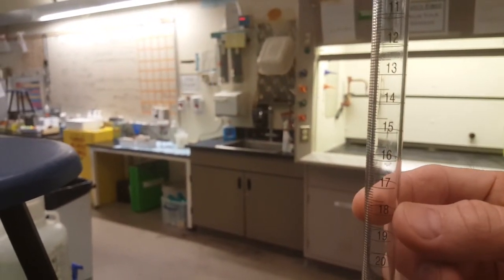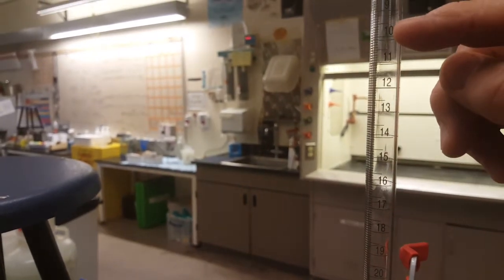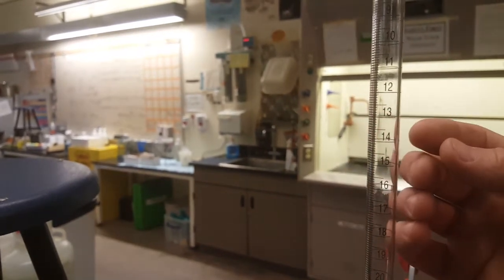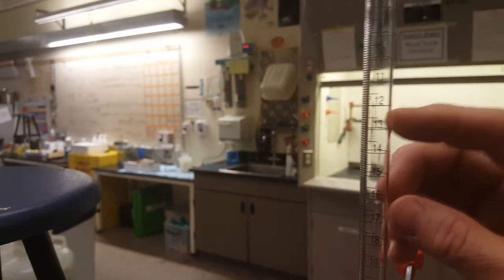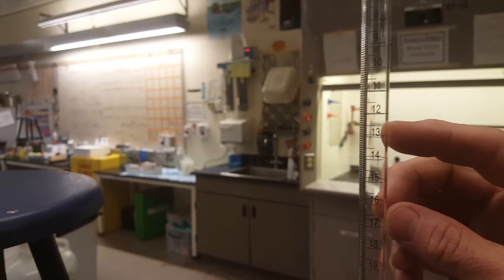So you're used to graduated cylinders increasing in number from the bottom to the top, and a burette is meant to help you measure how much you've poured out of it, not how much is in it at the beginning. So when you're measuring with your burette, always do final minus initial.